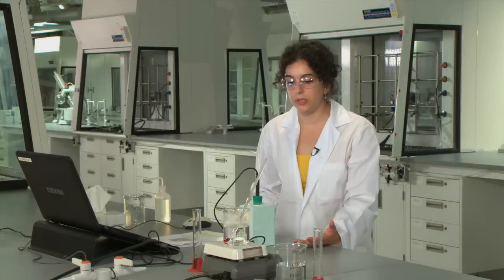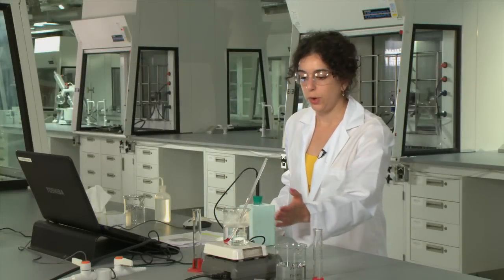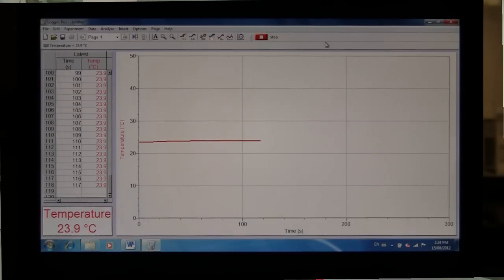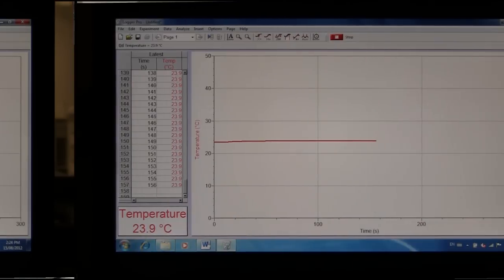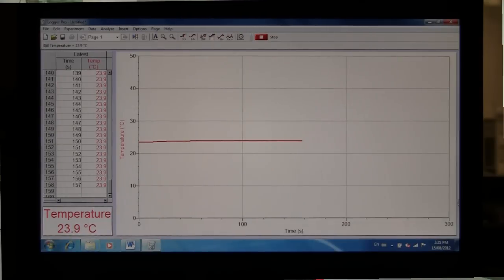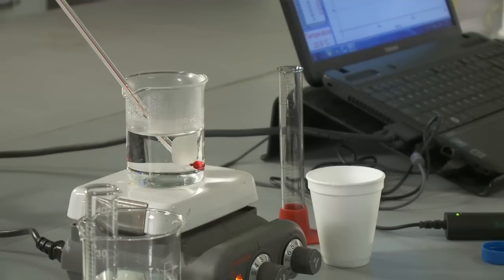In the meantime what you can do is get a hot plate set up with some water and make sure that it's heated roughly around 60 or 70 degrees. So now we've come up on the 125 and counting so we're almost there and when it reaches around 160 you're going to want to record the temperature value that's displayed in the software. This corresponds to your initial temperature of your cool water or room temp water.